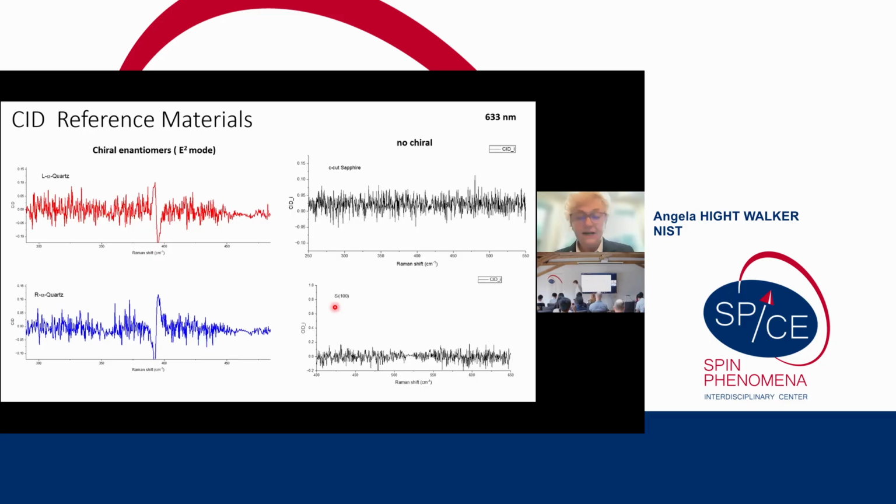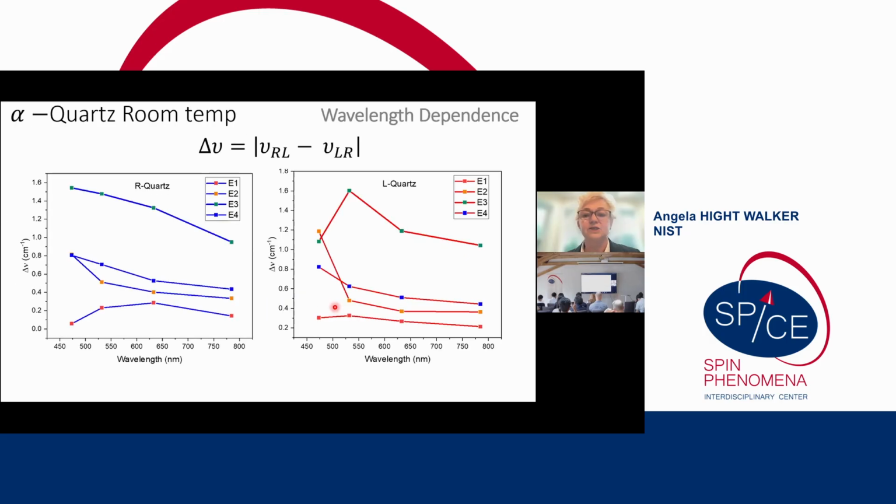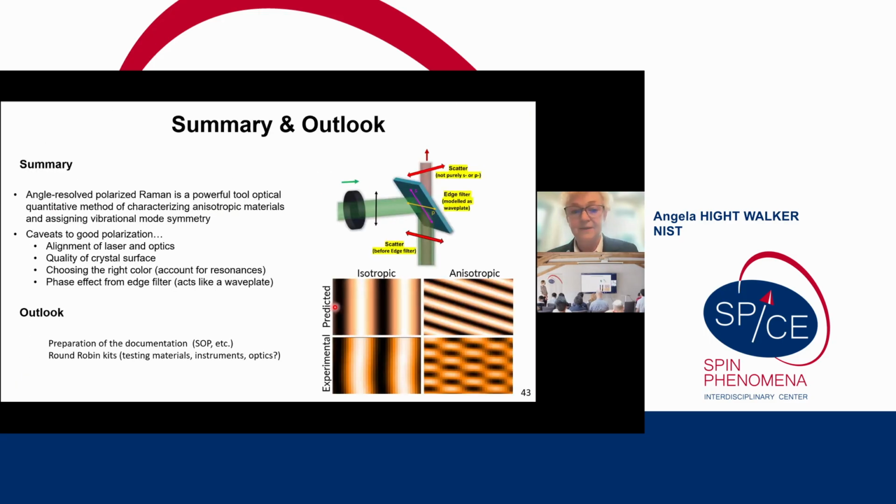I apologize, I am running out of time, so I'm just going to quickly show you there is wavelength dependence to using quartz. I unfortunately don't have time to talk about it. Also, there is a temperature dependence. Many of us are doing temperature dependent measurements, and so these 2 things are very important and need to be kept in mind. So again, I thank you all for your attention, and I apologize I got over time.